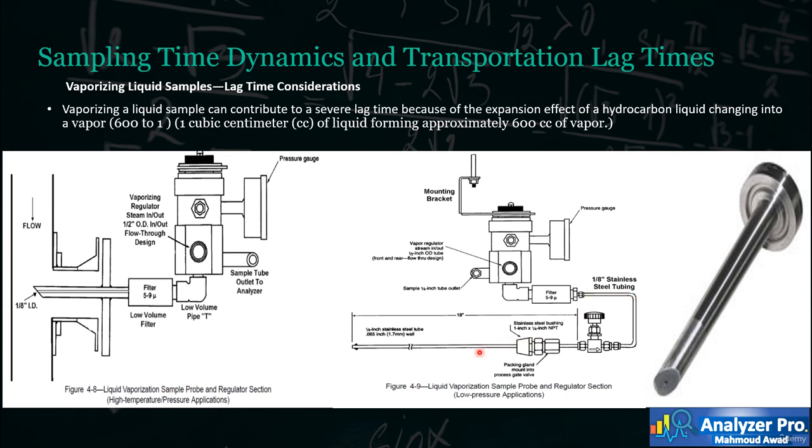All this is done to minimize the liquid volume before the vaporizer as much as possible and get a representative sample.